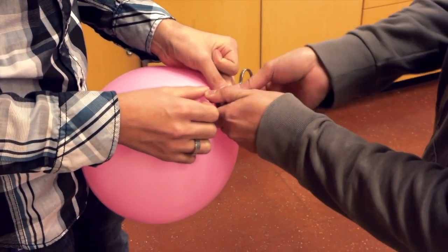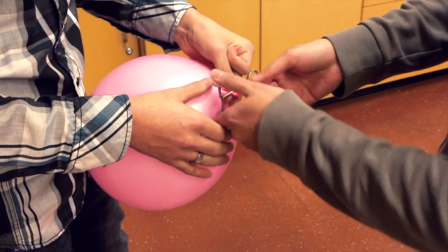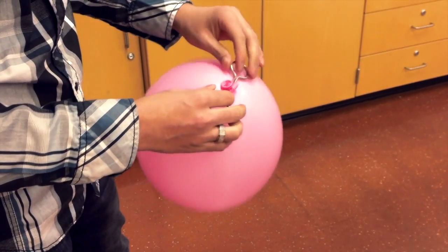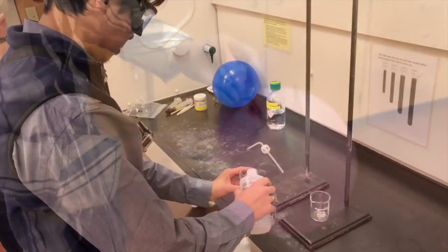We're going to start off by clamping a balloon using a spring clamp. As you can see here, it works a little bit better with two people. You can do it by yourself, but with two people it just makes things go a little bit smoother.